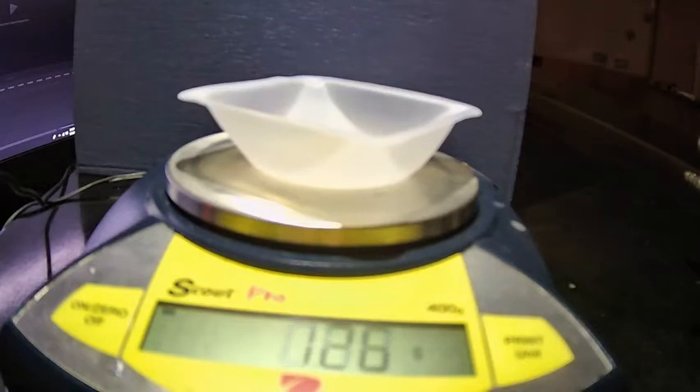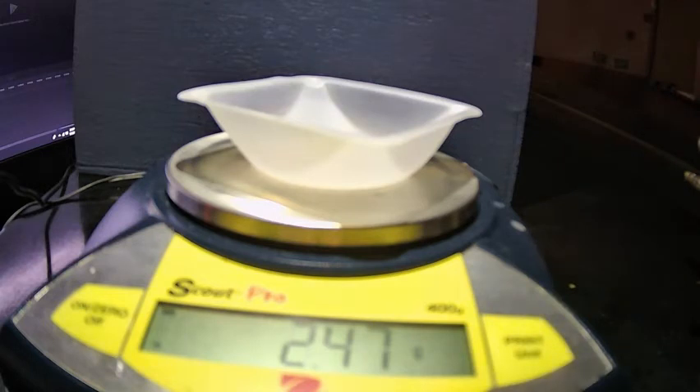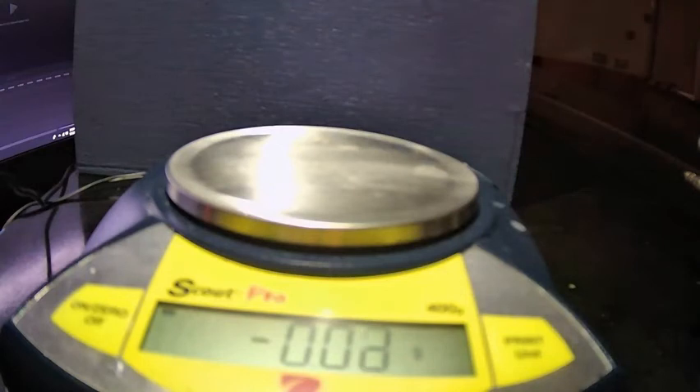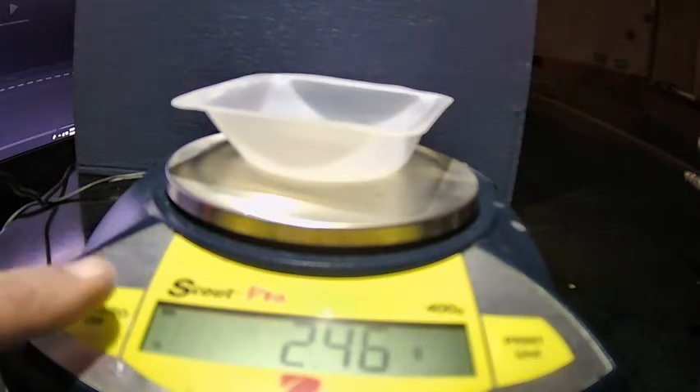One important thing: you need to make sure you tare or zero the balance before you use it. Notice this balance already has a number on it. If Sally just goes ahead and measures — boom, 7.86 grams — that number wasn't zero when we started, so we don't actually know how much was in there. Let's try that again the right way.